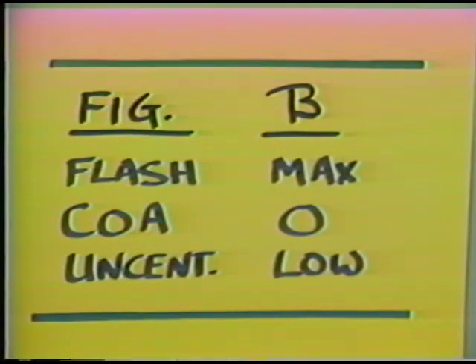Well, you can also relate the birefringence of a particular mineral grain to the kind of interference figure that you obtain. And this chart summarizes that relationship. A particular mineral, if it has the same thickness, will show its maximum retardation when it is in the flash figure orientation, or when the c-axis is lying on the stage.